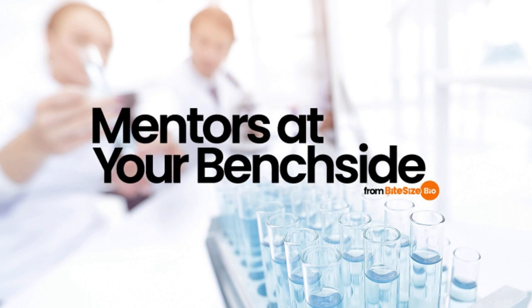I'm Laura Grassi, and today I'll be talking to you about how and why to measure and improve your accuracy and precision in the lab. One of the first things that any scientist should consider when measuring any attribute, whether it is the concentration of a solution, the quantity of DNA in a sample, or fluorescence intensity, is how accurate is this measurement.